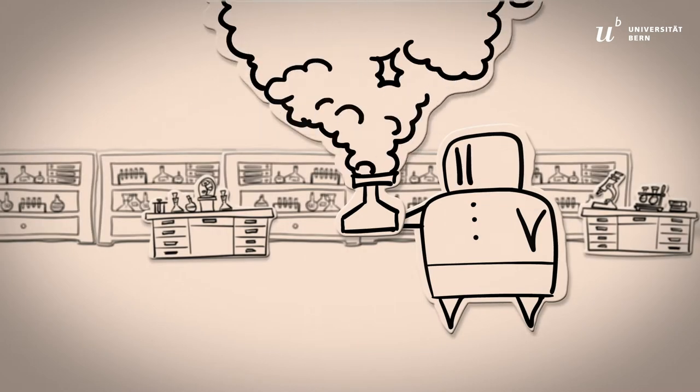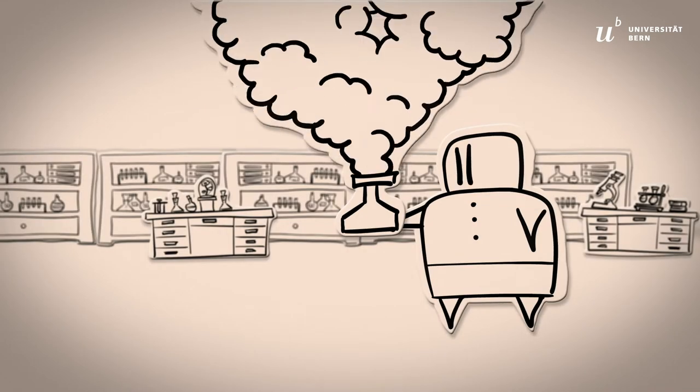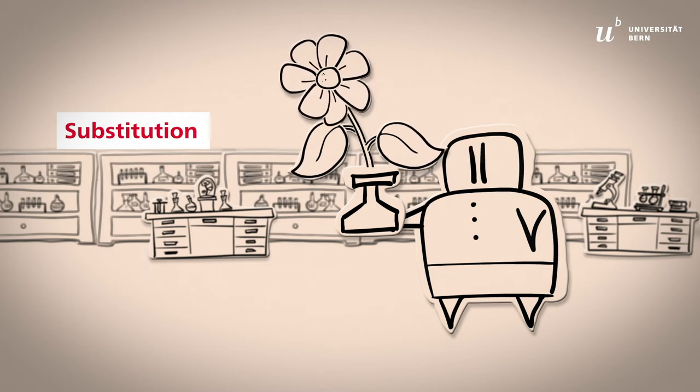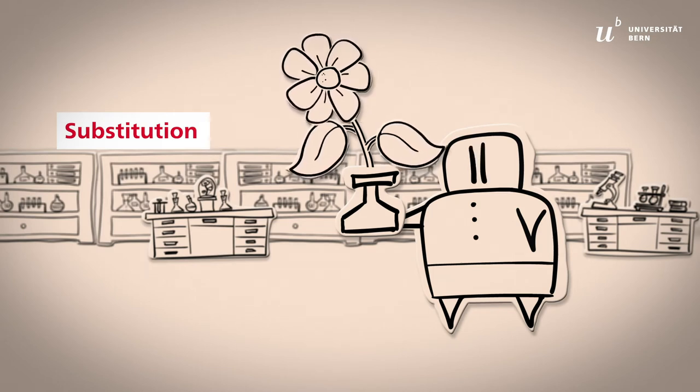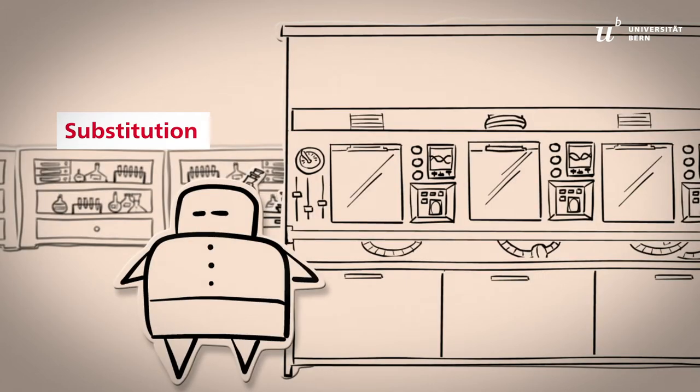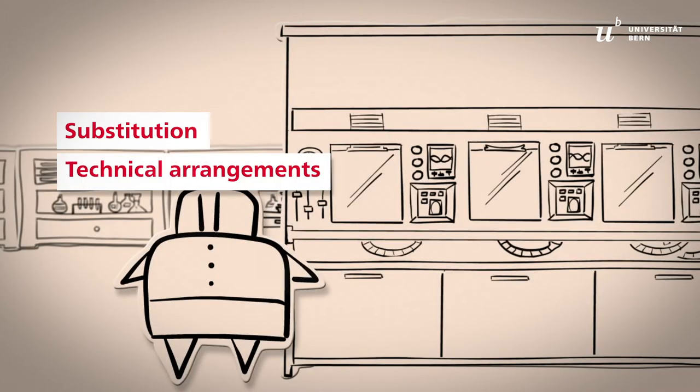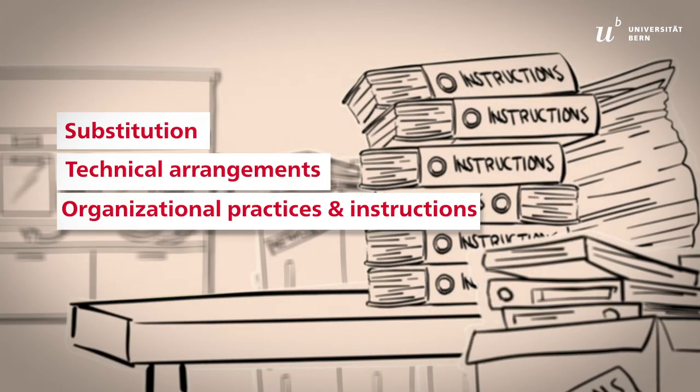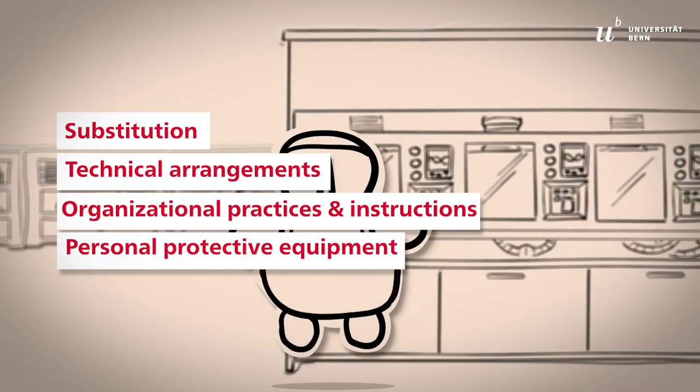The safety measures are governed by four principles. The first is substitution. Whenever possible, replace the hazardous substance with a safer alternative. The other principles concern technical arrangements, organizational practices and instructions, and personal protective equipment.